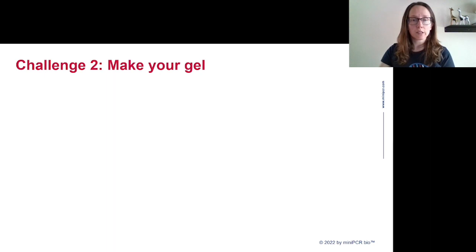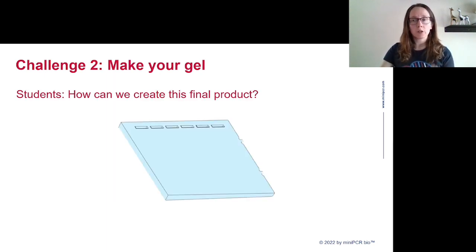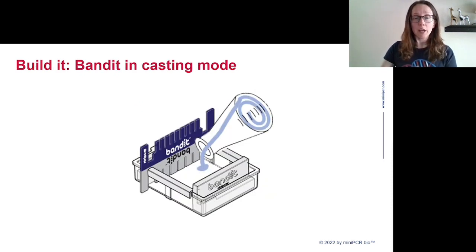If you do want your students to take this step and use it as a learning opportunity, they'll approach it as a critical thinking exercise. We frame this challenge to students like, how are we going to create this final product? We have this brick of agarose with these wells in it. How do we get from point A to point B to this final gel? We make gels by casting them. We make a mold, and then we pour in melted agarose, and when it hardens, we have our gel. It's really just like making jello, right? We melt it down, pour it into our molds, and then we have our jello centerpiece for our party tonight.